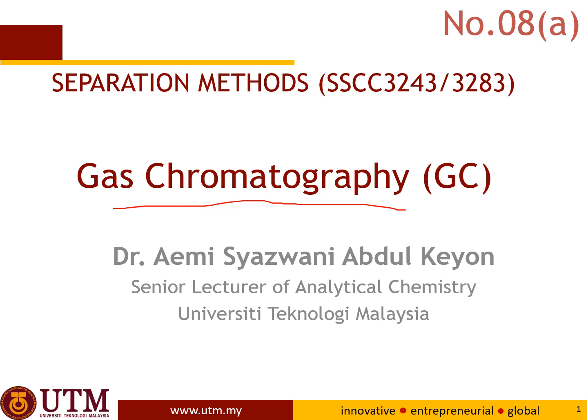how and why this instrument is used largely in industry. What the GC topic will cover, if you see from these slides, is some fundamental parts, then the components in GC, and then application. But application is only a few of the applications. So I will speed up the parts of GC by showing you the video made by my students last semester and a few semesters before on the A to Z of the parts in GC.